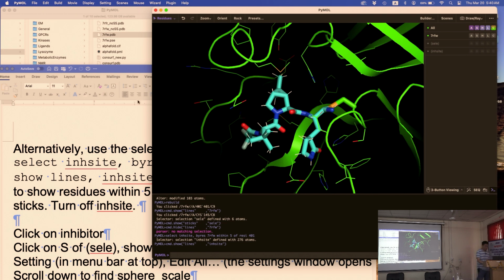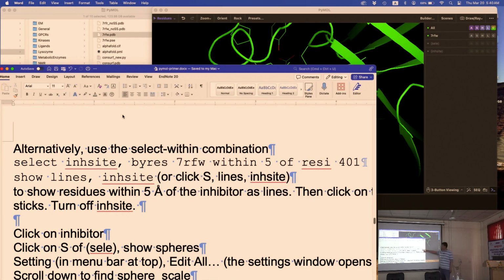This command here? This top one? Okay, all right. After this one, try this one, show lines. You can do that, or you can go here, show lines, because once you type that in, you should have an object open for you here. Do you see it? Okay, go there, say show lines. You should get the same as what I see. You can modify this command to your satisfaction however you want, but this is just the beginning. Also, if you want to do something in PyMOL and you don't know how to do it, Google it, you'll find the answer. Are we all okay?